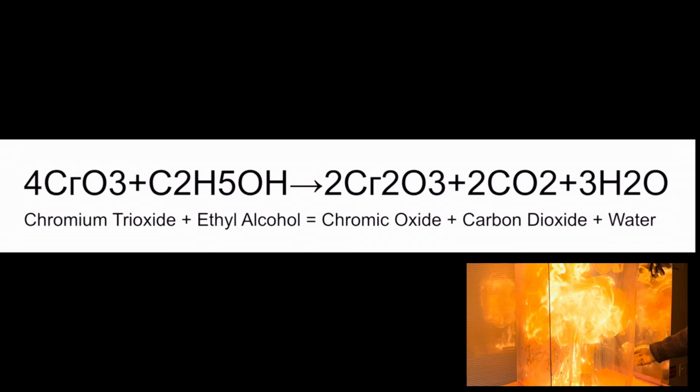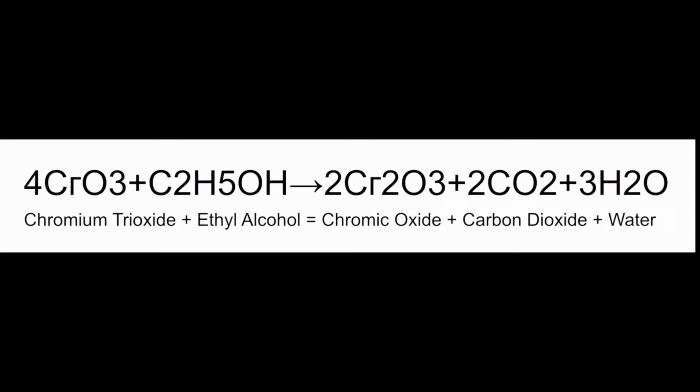Remember, this is a reduction oxidation reaction. So the ethyl alcohol is being oxidized as it rapidly loses electrons, while the chromium trioxide is being reduced as it gains electrons in this amazing exothermic redox reaction.